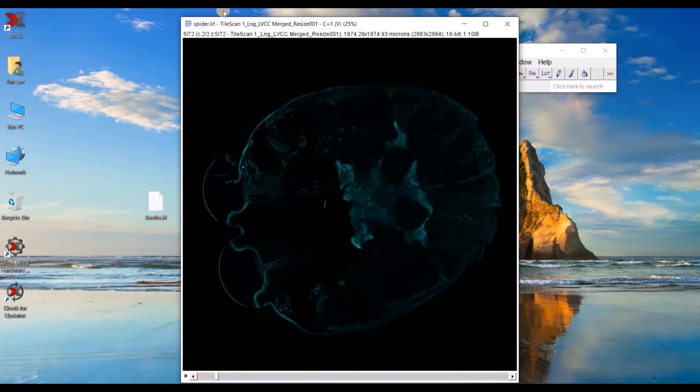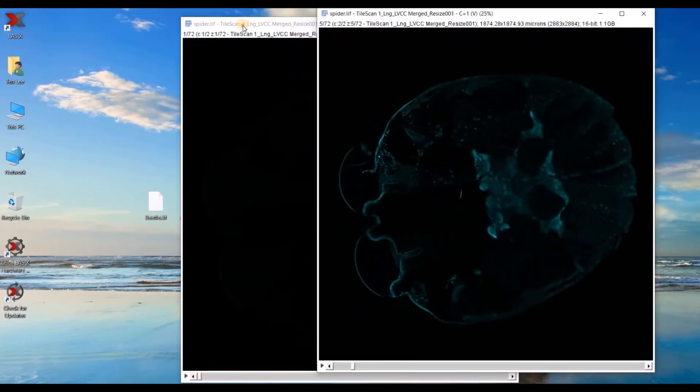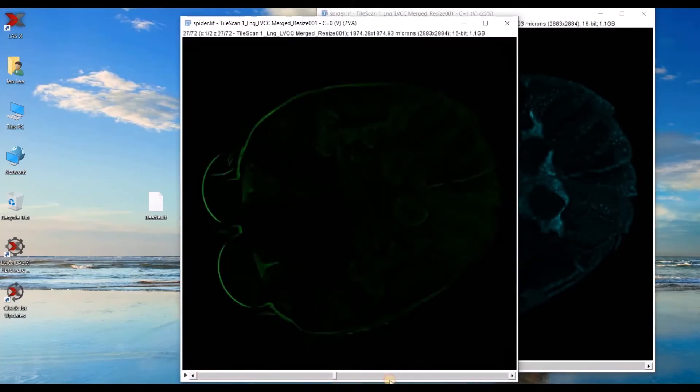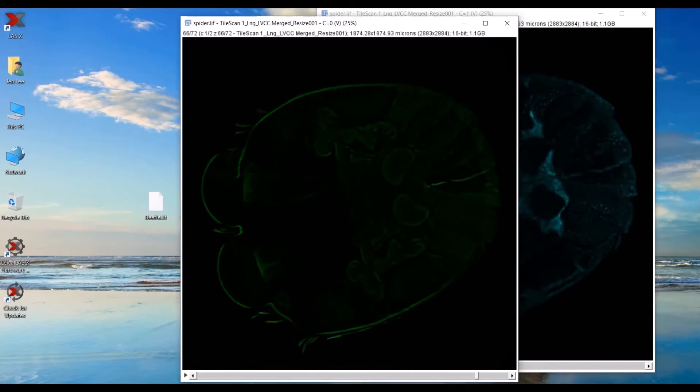You can always change the brightness or contrast if you need to. And then in my other channel, same thing. As I scroll through, I can see my second channel.